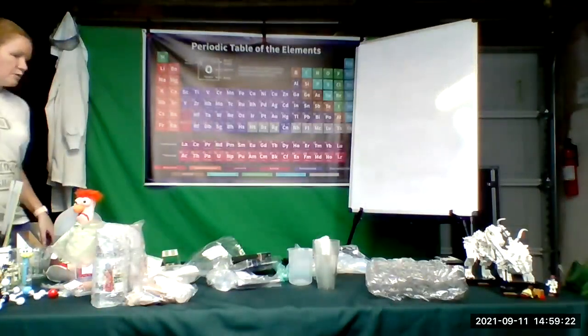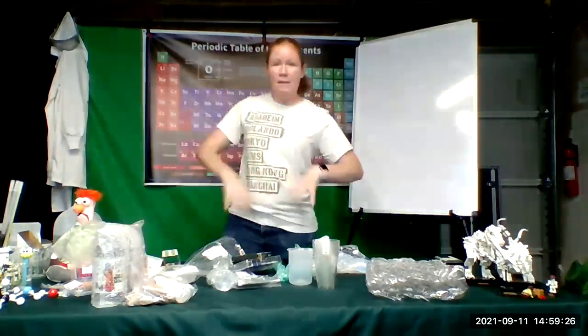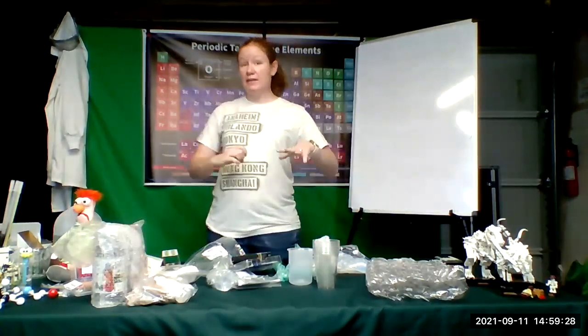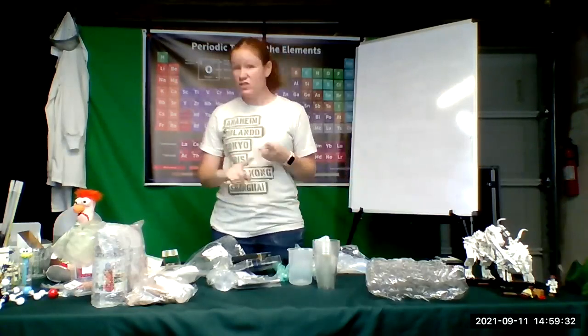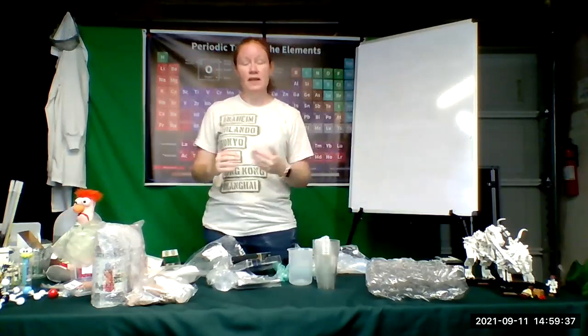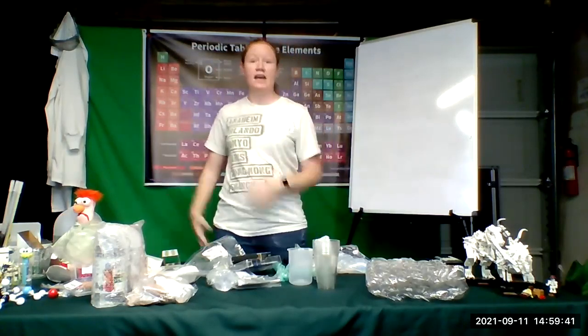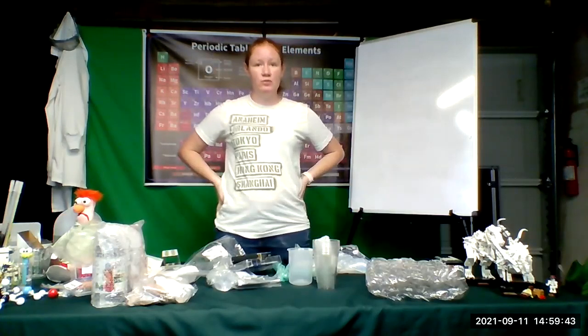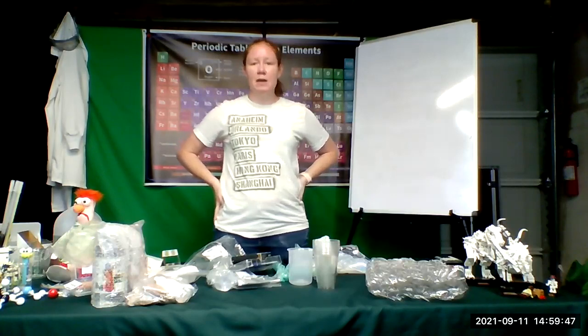It will tell you what you need from your equipment kit, from your chemical sets, and then from that particular experiment. And there will be pictures. And then there will also be a list of anything you need, like distilled water or salt or sugar or things like that. So every experiment will lay it out. Okay, and you'll see that when you prepare your pre-labs for Tuesday or Thursday for this week, as you go through that first experiment, exploring physical and chemical changes.